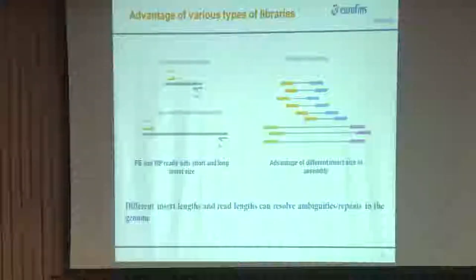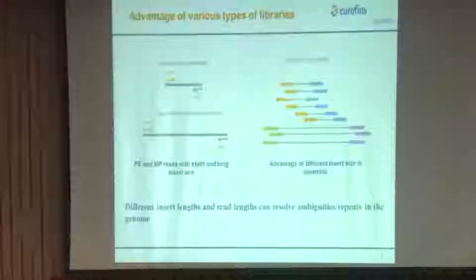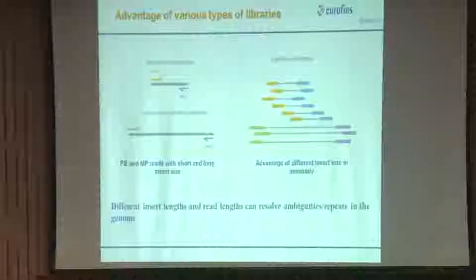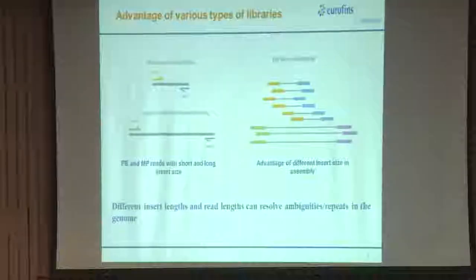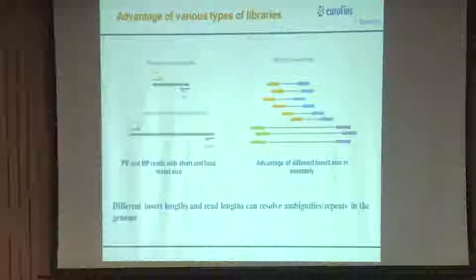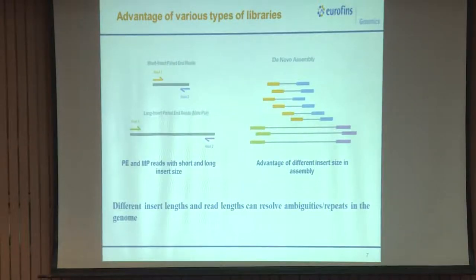We also have smaller chunks. If you have seen in NCBI, we have contigs, scaffolds, chromosomal level. These are different levels of genomes which we find in NCBI. What are those? First we go for contigs, then we go for scaffolds. How we go for contigs and scaffolds, we'll see. And this is the behind part of creating a contig. And from contig to scaffold, if I want to go, I need a library like this, wherein it will have an overlap of one or a partial overlap, but these reads will fill up my gaps.